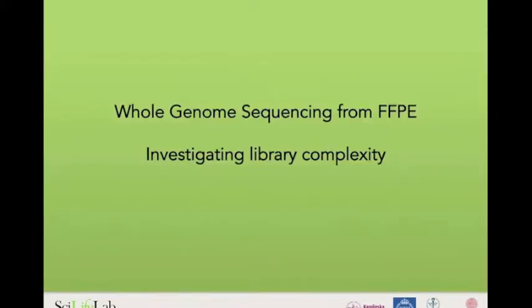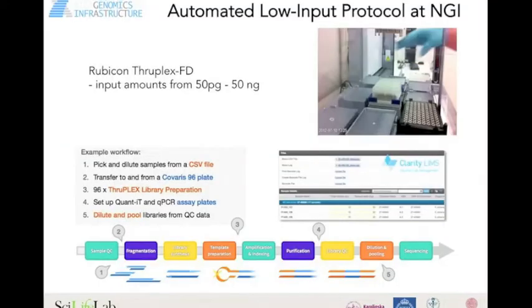What we've looked at initially, and what I will be talking about today, is whole genome sequencing from these samples, so not targeted sequencing, which Pavel highlighted.